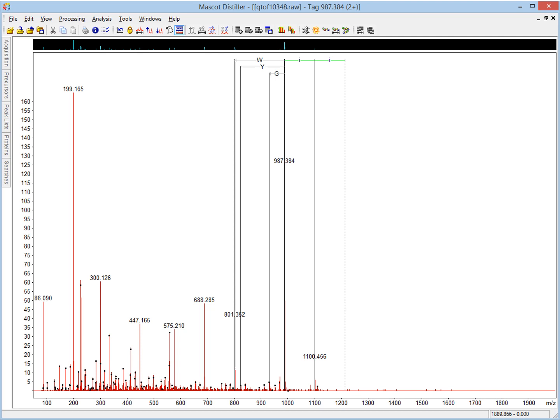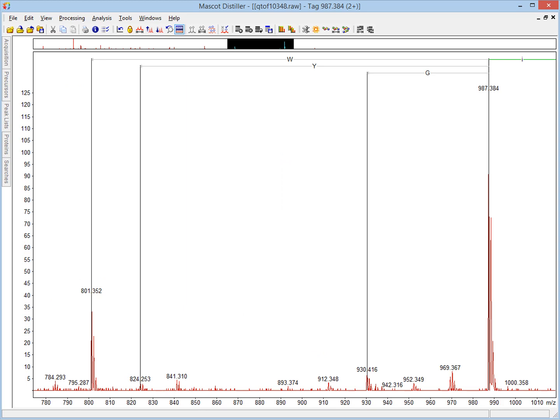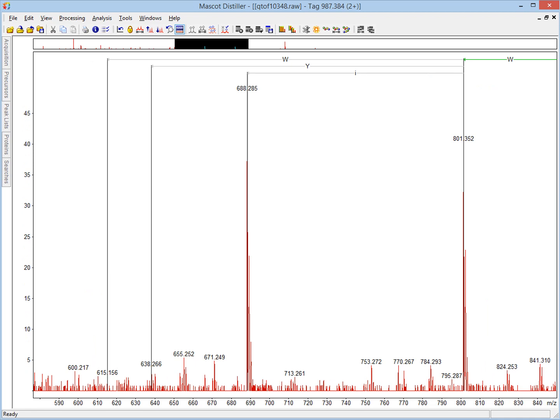Going to the left, there is a choice of 3 residues. Zoom in for a closer look. No doubt that tryptophan is the most intense, so we click on the arrowhead to extend it. Again, a choice of 3. We'll go with the isoleucine.